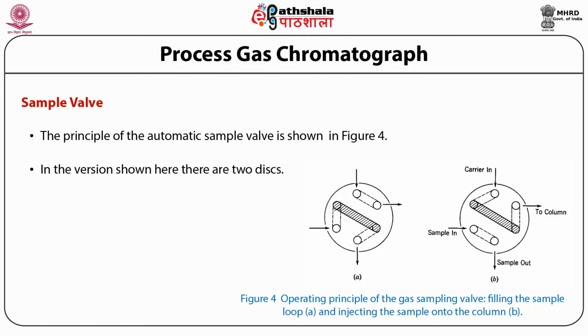With liquids, very small volumes are involved, only a few microliters. For this reason, liquid samples are usually vaporized and a vapor sample is injected into the column by means of a heated gas sample valve.